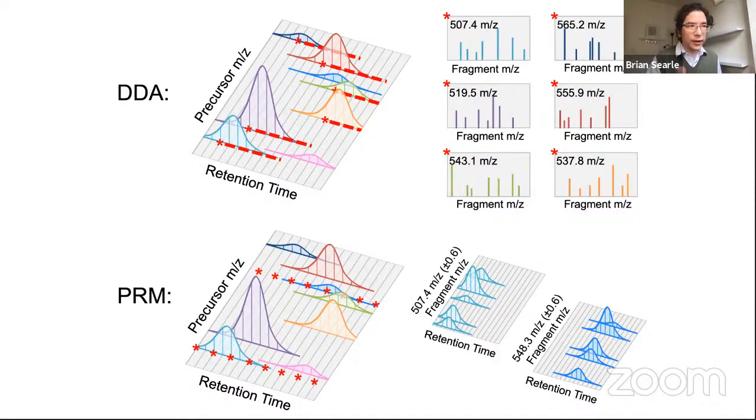And so, yeah, Julia, you make a very good point. We do have a limit on the number of masses that we can assign in a PRM experiment. Typically, in a normal PRM experiment, we're only really able to analyze something between 150 and maybe 300 different peptides at a given time point, corresponding to maybe 50 or 100 different proteins. So we're not able to measure an entire proteome here. We're only able to measure a handful of peptides belonging to a handful of proteins. So that's definitely a complication of PRM that makes it limited in some circumstances.